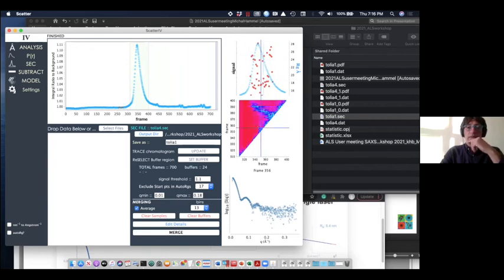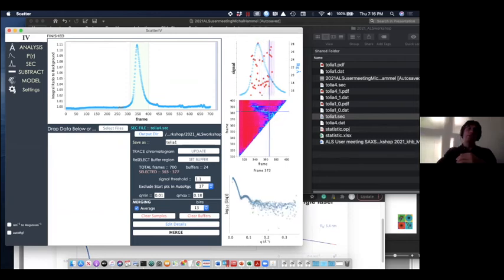But obviously, you have a different, based on a similarity map, and Rob's gonna mention that probably here, based on a similarity map across the peak, you see those frames are very different across the peak, especially in the region of the main peak. So you have different scattering profiles, but most likely it is the partial complexation of your apoferritin with your recognition protein, not antibody, some protein that is functioning as antigen. So that is already seen here.